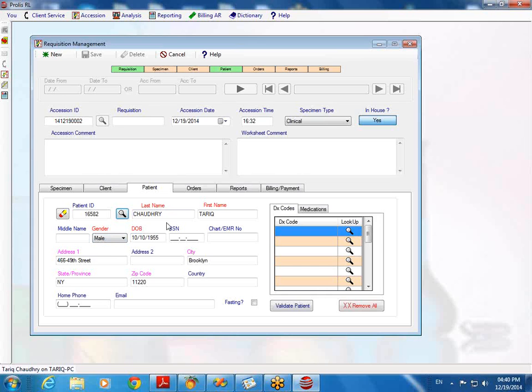No, I'm sorry. The system changed the gender of the same patient. While this ID is here, the system changed the demographics of the patient through this screen. But if this ID is not there, then the system will create another patient if you change any of the elements from these red color fields. So it's a very well organized way that the system keeps the integrity of the patient inside. So to keep that integrity, we recommend that patient information be entered through this screen, not imported.